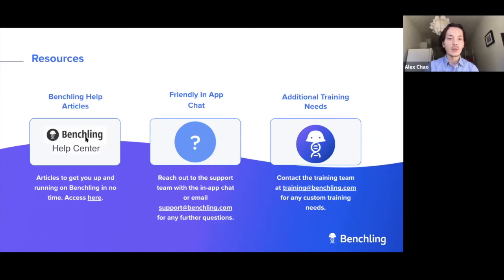In terms of resources moving forward, if you ever need help while utilizing Benchling, please do leverage these Benchling help articles. These again are located at help.benchling.com. And this is an organized catalog of different help articles with screenshots and videos that help you to perform any functions that you need to perform within Benchling.